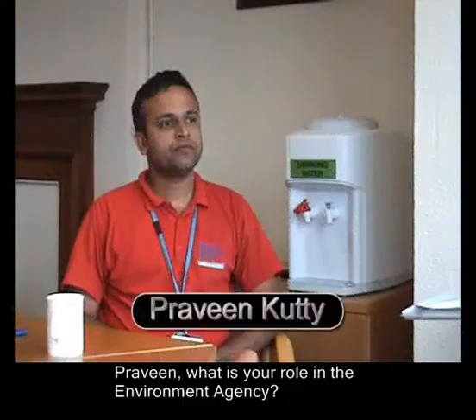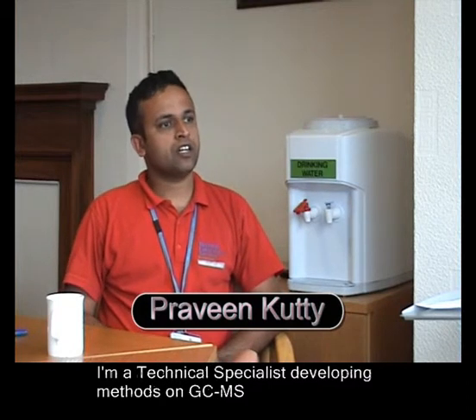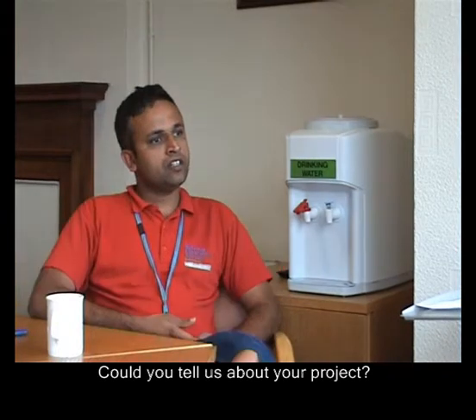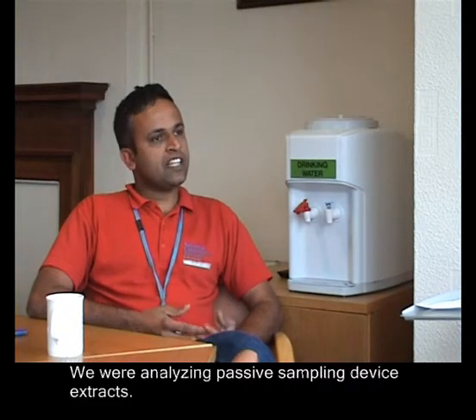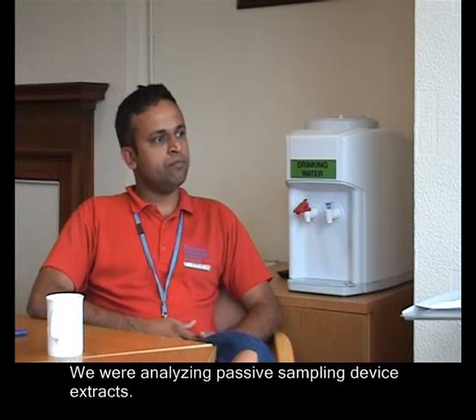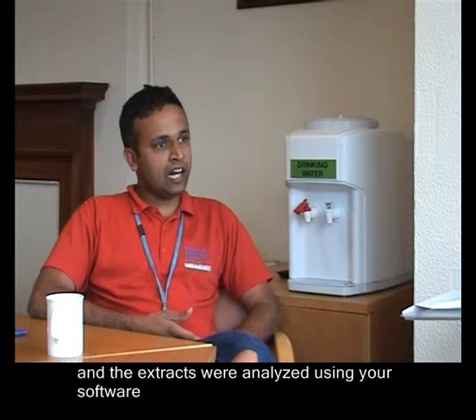Praveen, what is your role in the Environment Agency? I'm working as a technical specialist and currently developing methods on GCMS. Could you tell us about your project? We were analyzing passive sampling device extracts. The passive sampling device extracts were left on a water course for an extended period of time, and the extracts were taken and analyzed using the software.